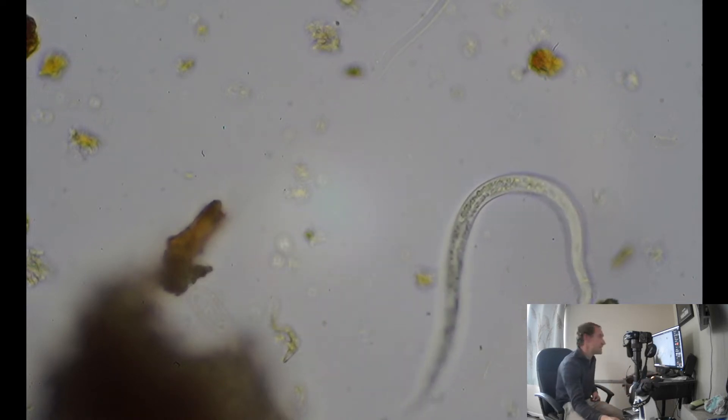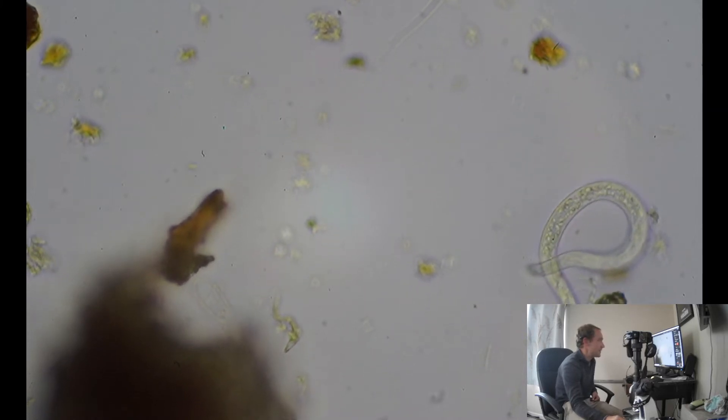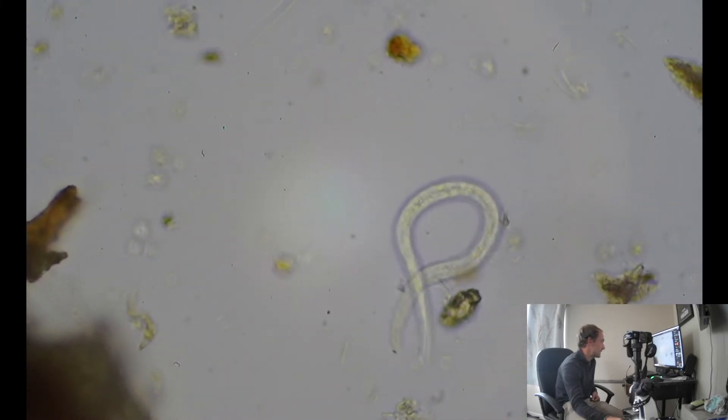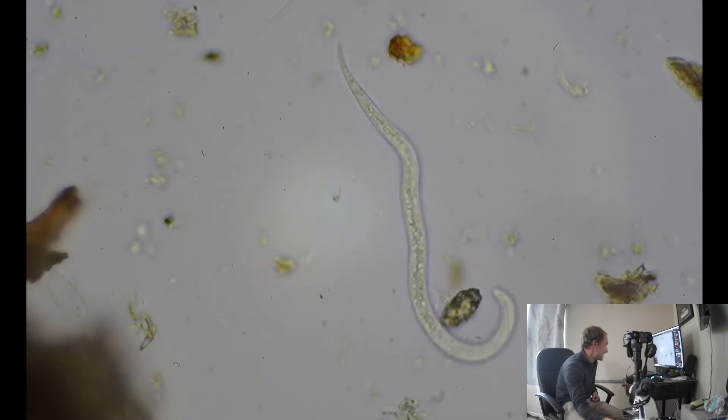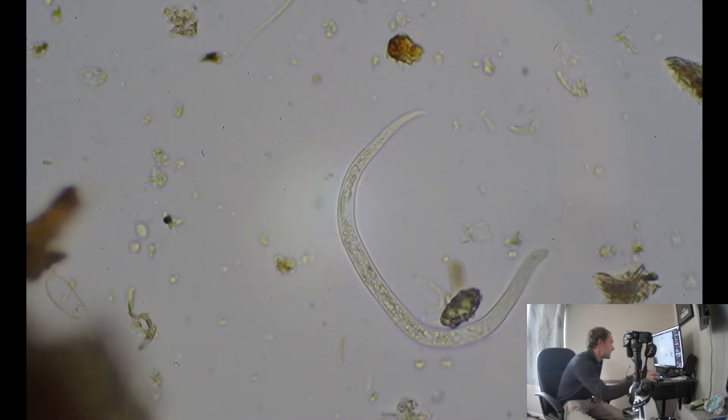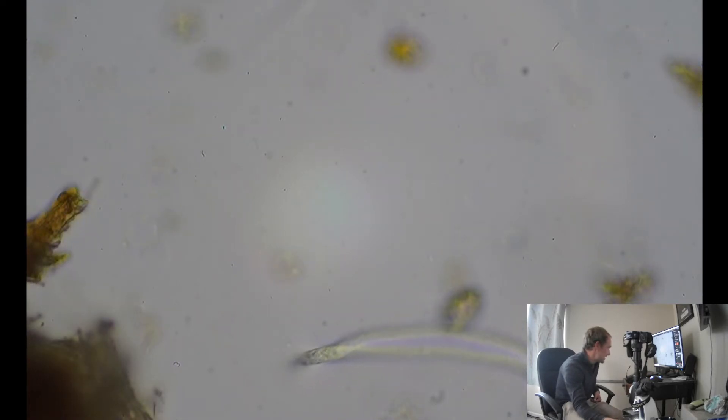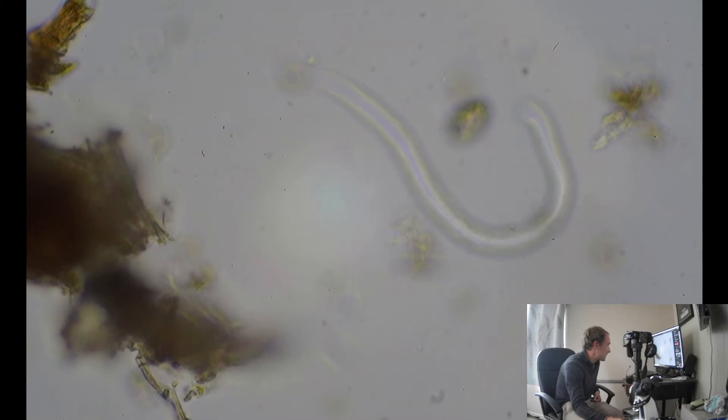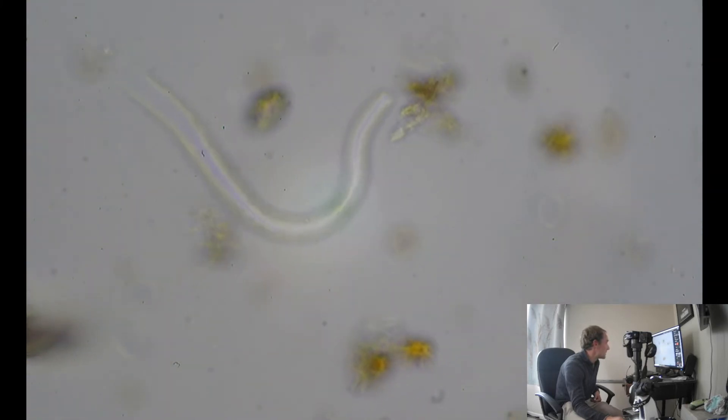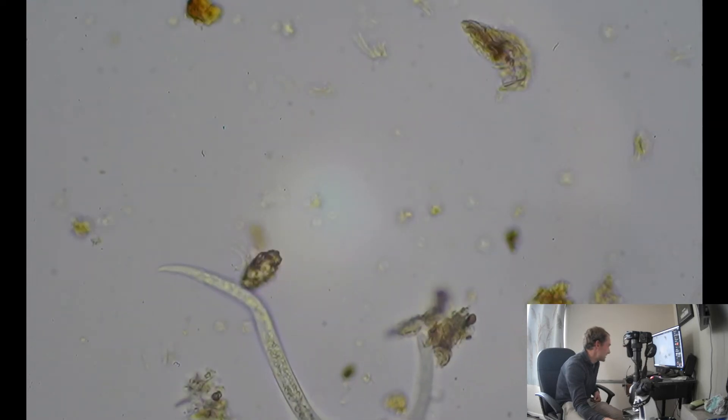Let me do a little recording on this. Oh yeah, there's a nematode at 400X. He's moving slower, so this may be a completely different one. Oh yep, and I think I see a spike in his head. I think he's searching for fungus. Yep, see that.